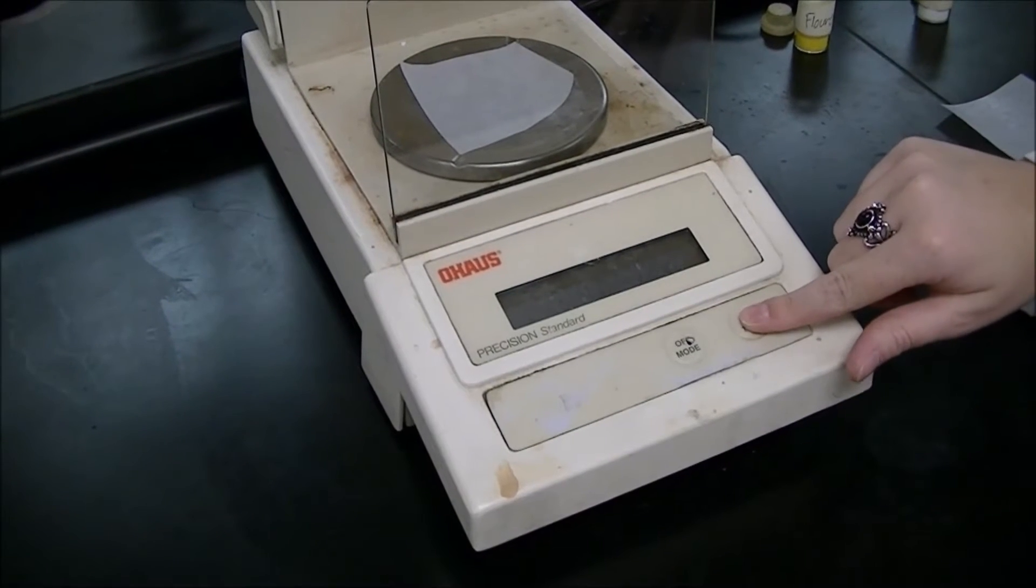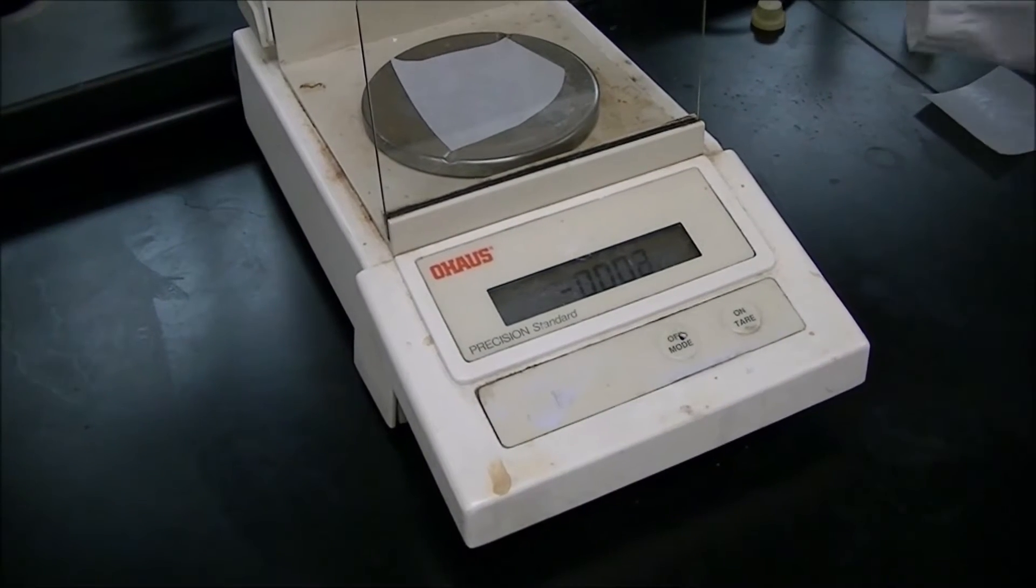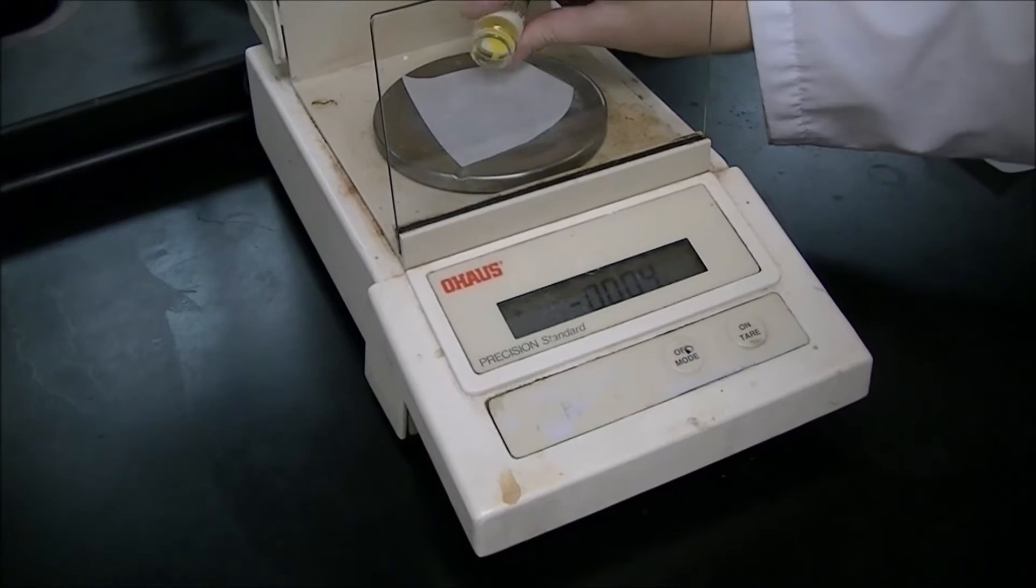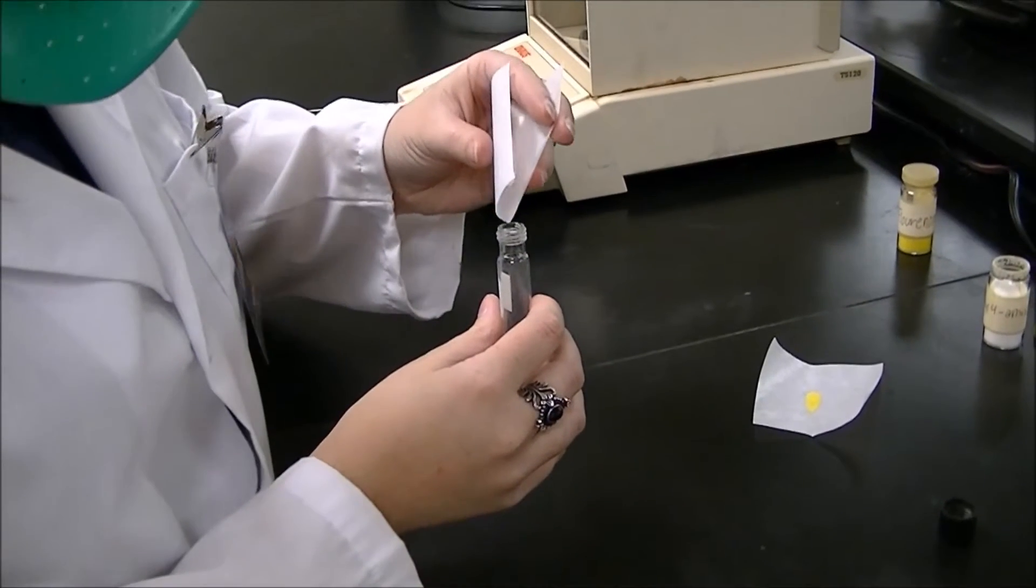Tare the mass of your weigh paper, and then weigh 50 milligrams of your 9-fluorenone and your ethyl-4-aminobenzoate. Add your two compounds to your centrifuge tube.